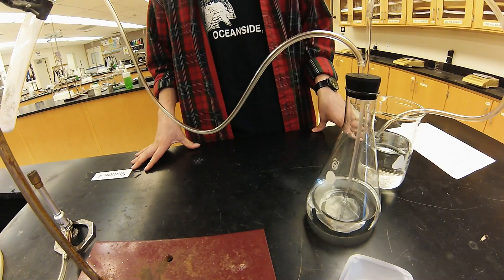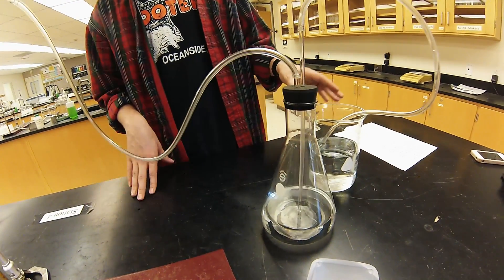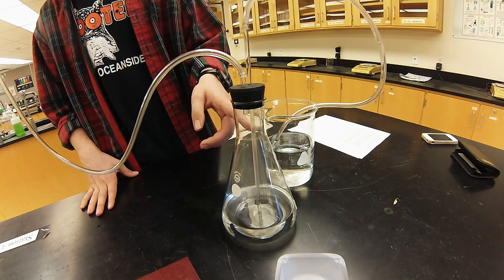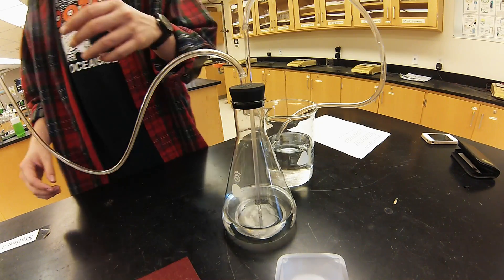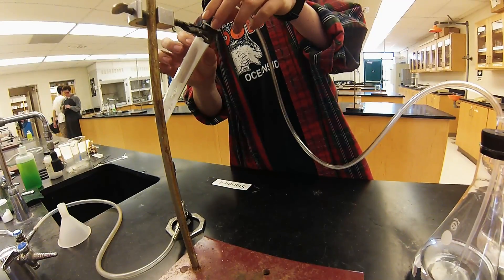After the system is cooled, we're going to equalize the pressure of the Erlenmeyer flask with the rest of the room. We break the vacuum that we formed by removing the stopper from the tube.